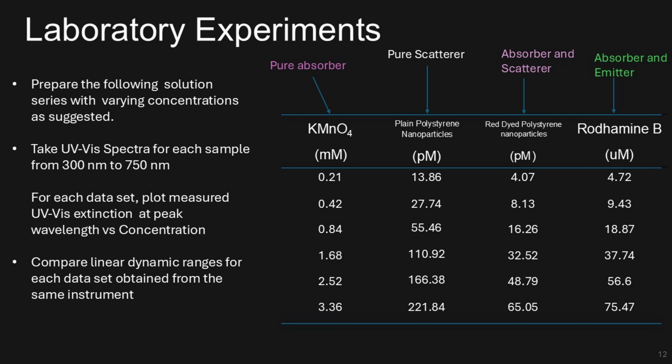This hands-on exercise can reinforce a key lesson. Not all the extinction is due to absorption, and interpreting UV-Vis data without considering scattering or emission effects can lead to inaccurate conclusions, especially for real-world and complex samples.